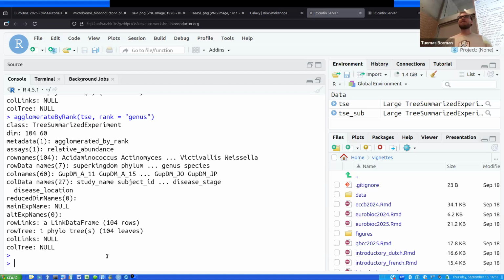Yeah, great. Just out of curiosity, am I right in understanding? I tried, silly me, I replaced genus by one across the whole column. I did that, and then when I agglomerate by ranks, I still have 3 genuses. So is my understanding right that it uses the whole tree to do the agglomeration, not starting with superkingdom and then within it 3 different superkingdoms? It found a group of 1 and a group of 1 in genus. Does that make sense?